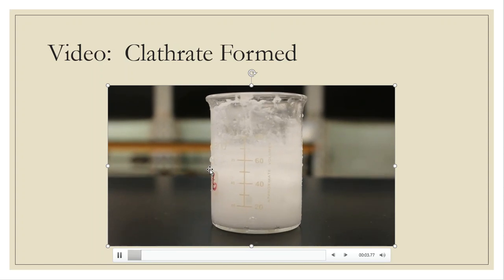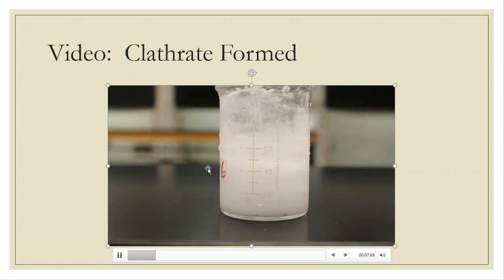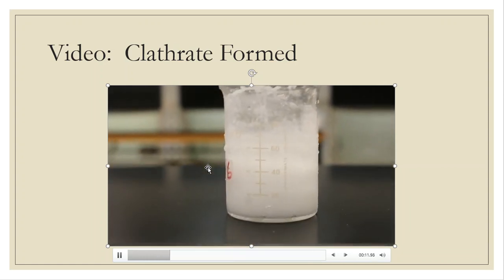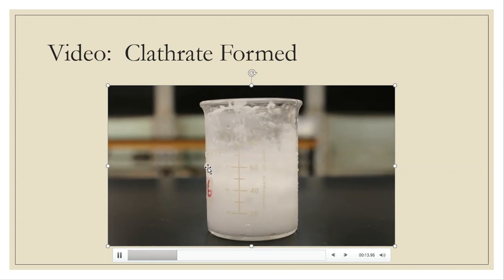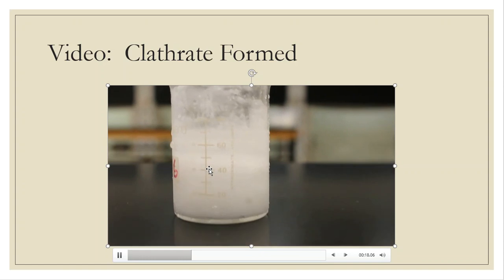Okay, so this is my alkane after it has been inside of the ice bath for at least 10 minutes. I kept it in there a little bit longer just because my methanol that I need to rinse with was not cold yet. So I just left it in the ice bath, no big deal. Nothing's going to hurt it.